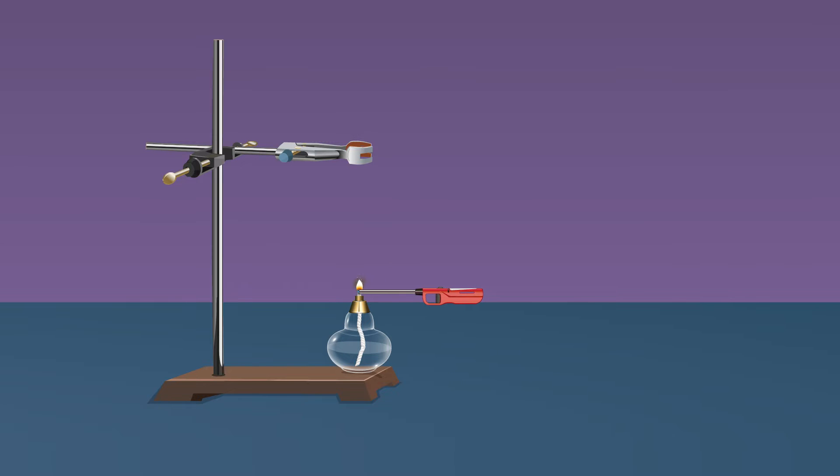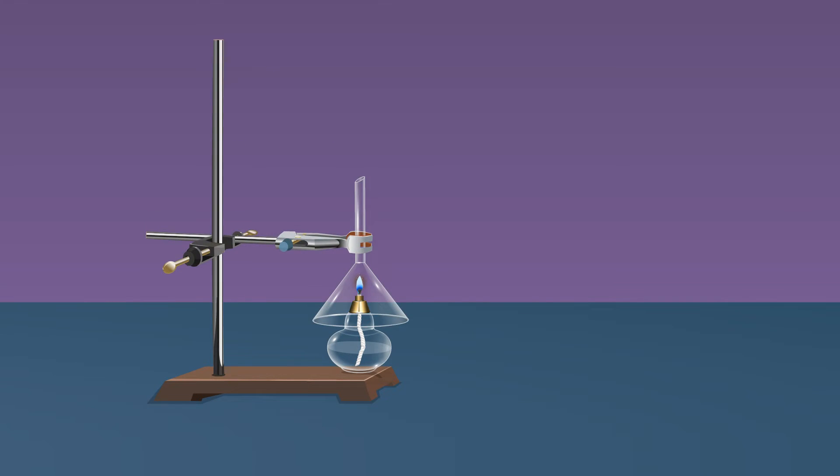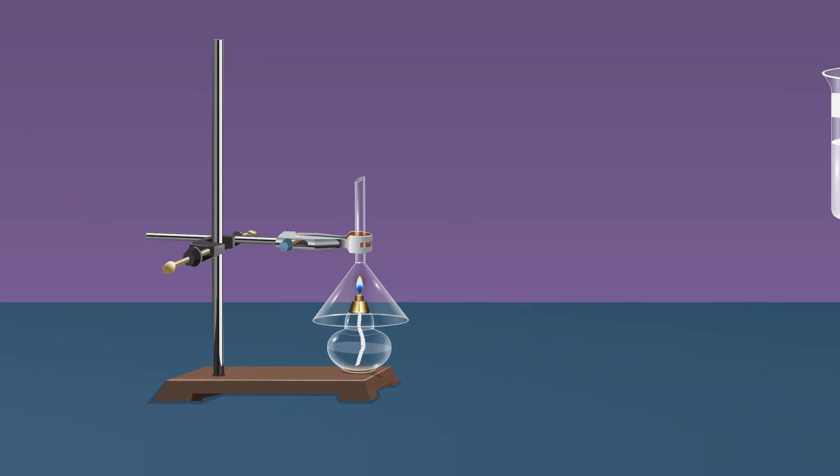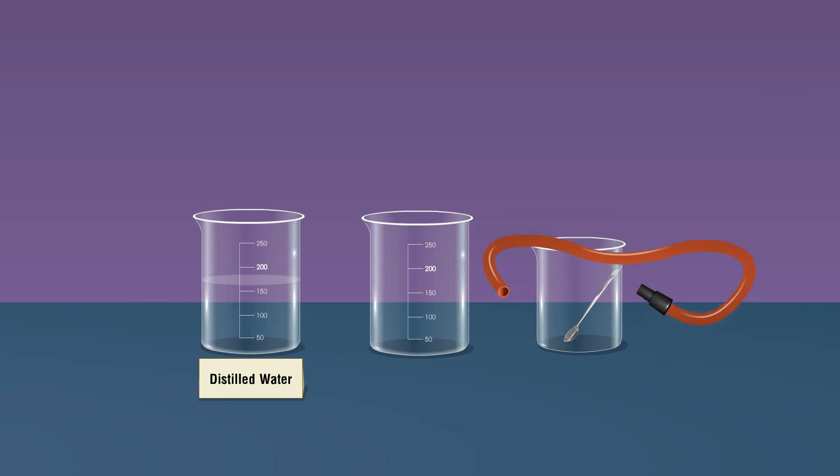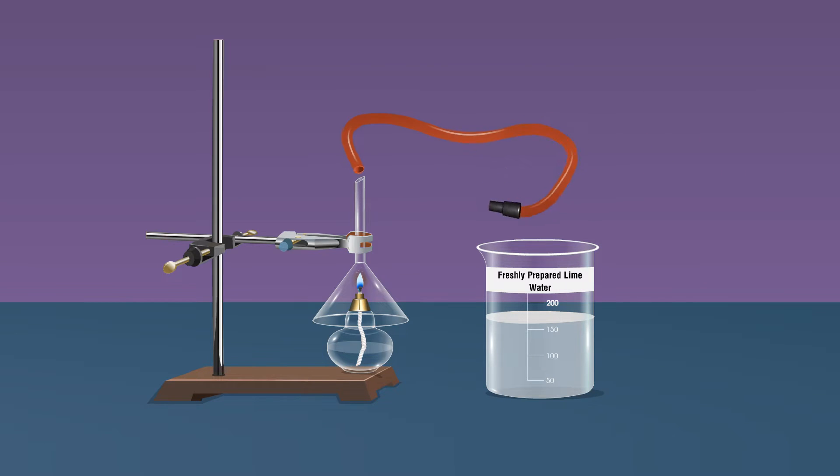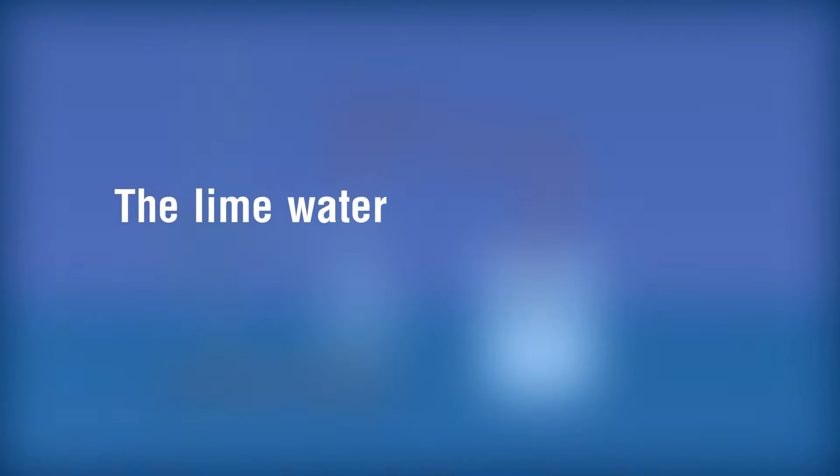Ignite it using a lighter and cover the lamp with an inverted funnel using a clamp as shown. Take freshly prepared lime water which is kept in a beaker. Take rubber tubing, fix the stem of the inverted funnel with a rubber tubing attached to a jet on another end. Pass the evolved vapors through freshly prepared lime water.